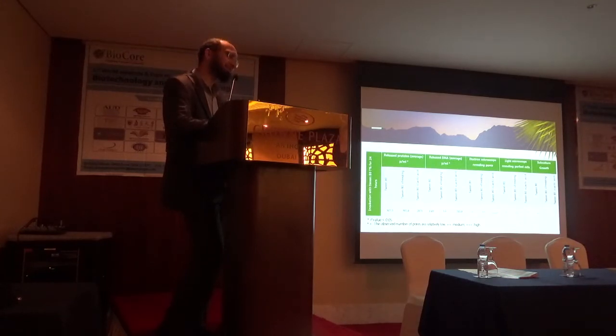All cells are intact and not deformed. By subculturing to confirm the safety of the product, Tween 80 showed subculture growth, which is not safe, and Tween 80 plus freezing was also positive. But with Tween 80 plus lactic acid, there is no growth after subculturing. It means it was a safe product.